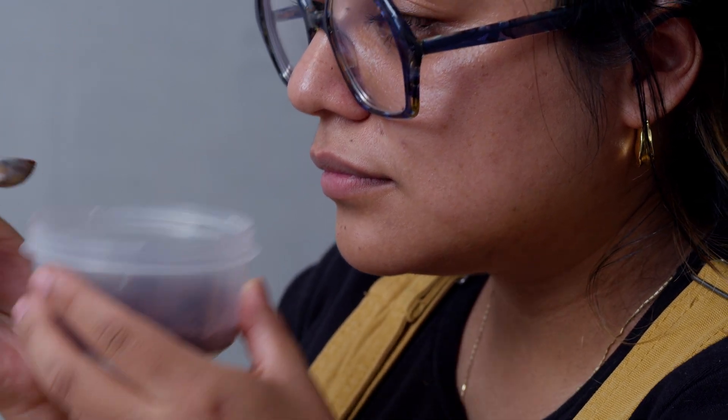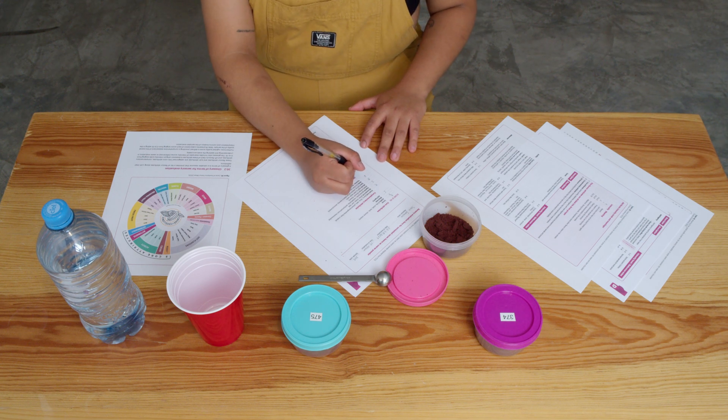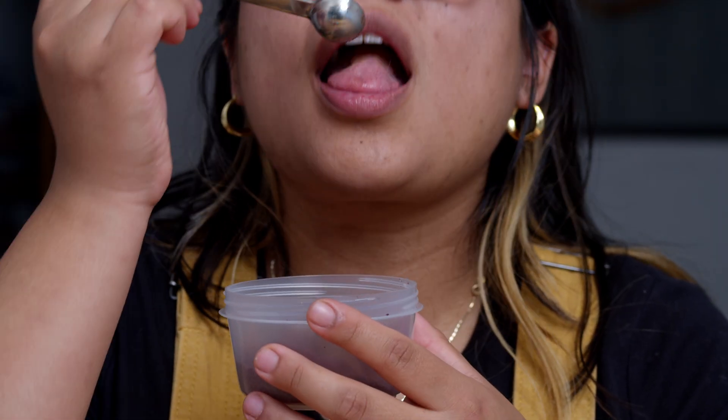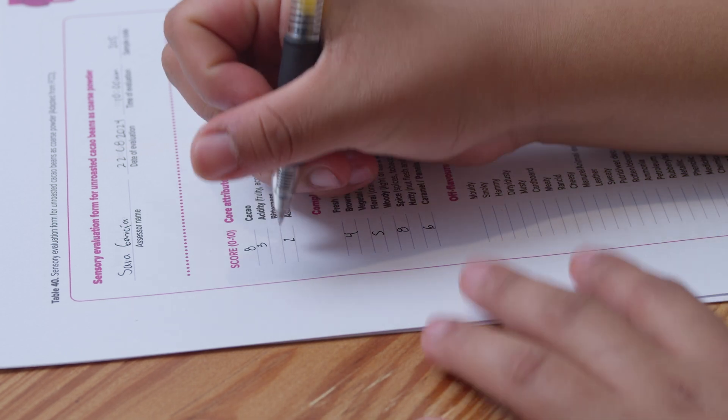Step 4: assess the aroma of the sample and record your observations in the comments section of the evaluation form. Step 5: place a half teaspoonful of the sample on the tongue and hold it in the mouth for the necessary duration needed to score the attributes, moving the powder across your palate. Do not chew.